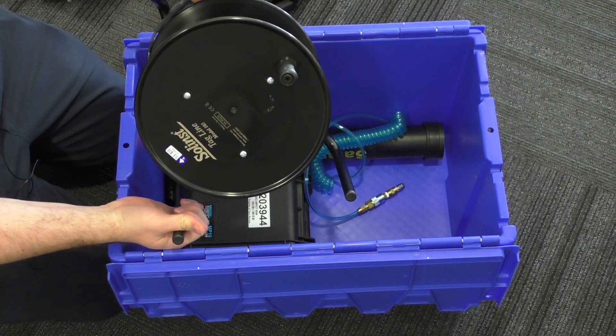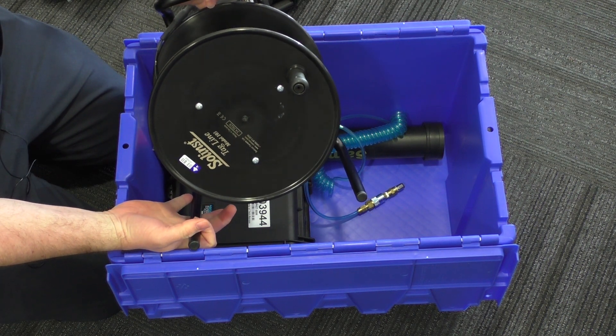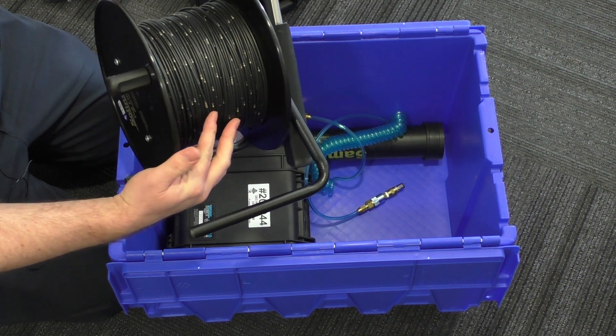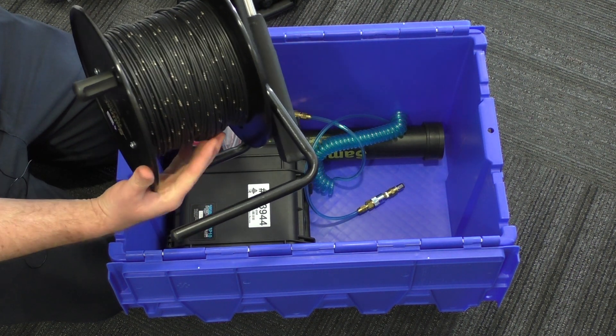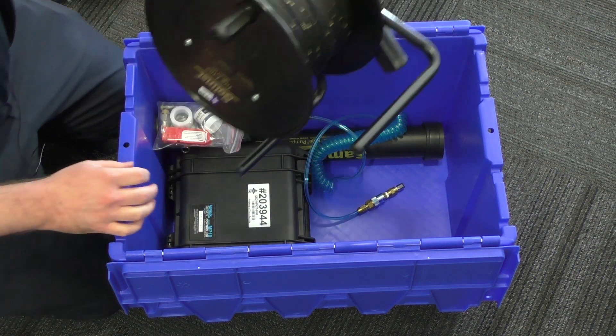To hang the pump down the well, we have a Solent's tagline. This is really useful because you can accurately place the pump to the depth that you need. It's also, being a coated wire, much safer — you're not going to get those metal whiskers digging into you from just bare stainless steel wires.